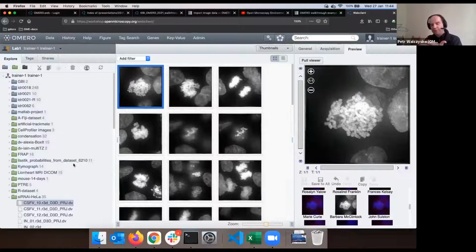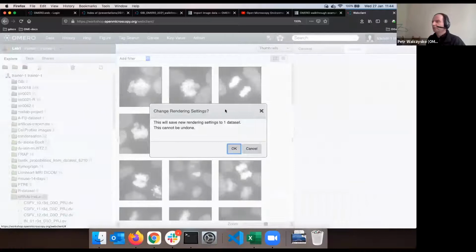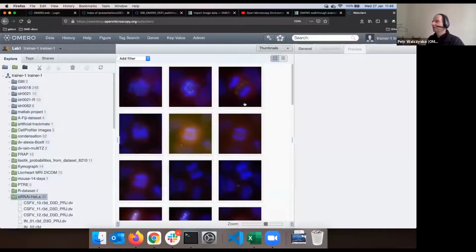And by the way, please don't ever delete anything on this server, okay? I can go back, maybe I'm not happy with Barbara McClintock's way to view my images. I want to view it my way. So I go again and set imported and save. Very good. Now let's go to the full viewer.